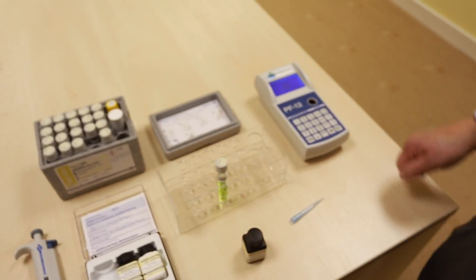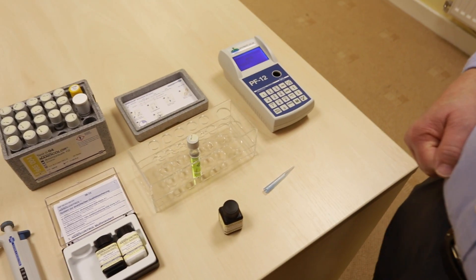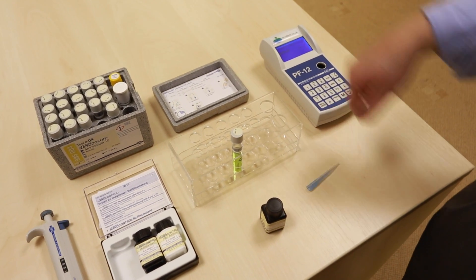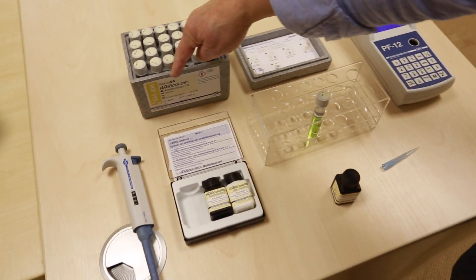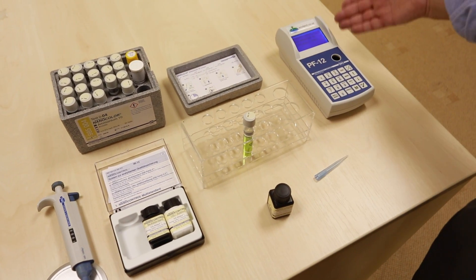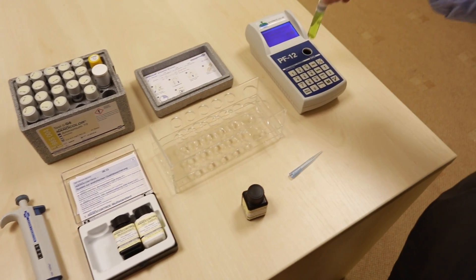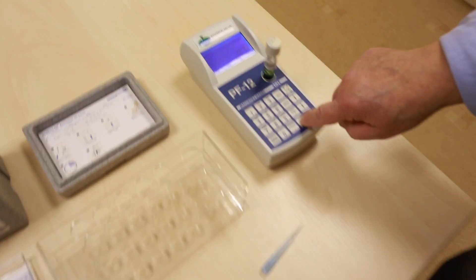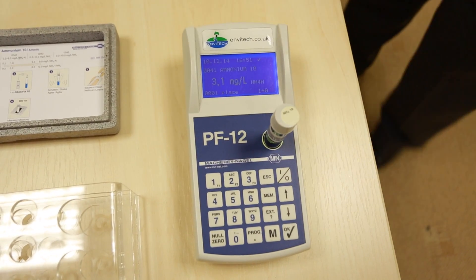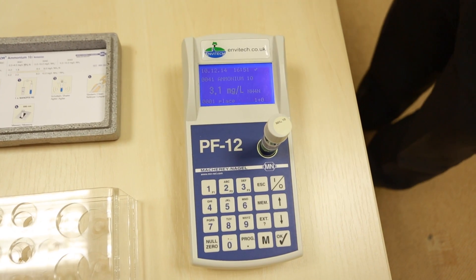We measure it in the portable photometer because most of these are measured out in the field. The method number is there, so we type in 004. It sets ammonium up and the expected range is 2.7 to 3.1. The standard has a nominal value of 3mg per litre.